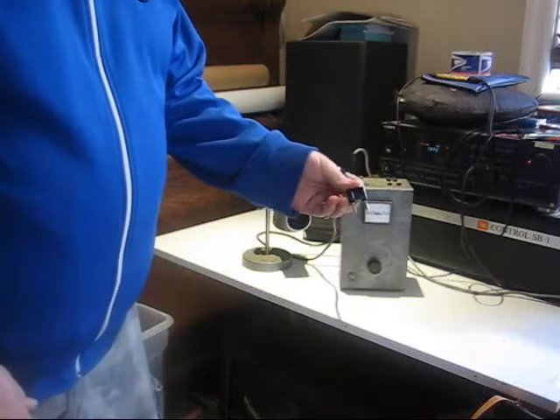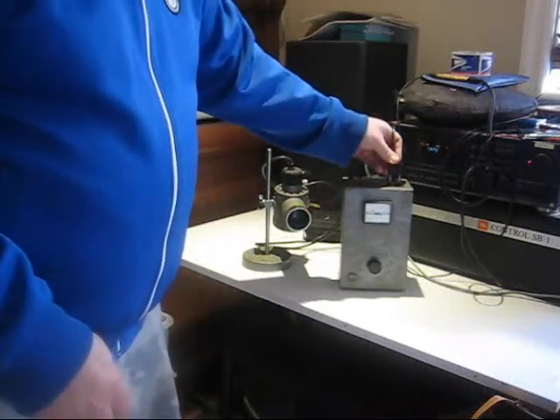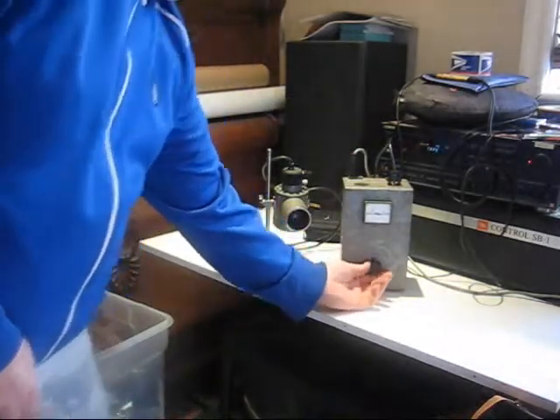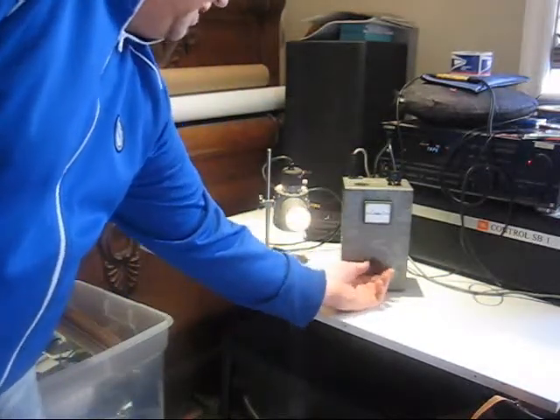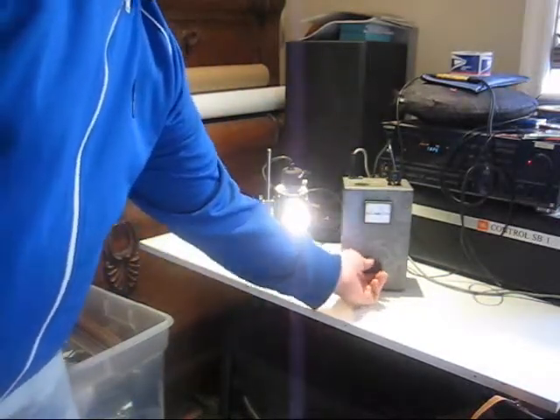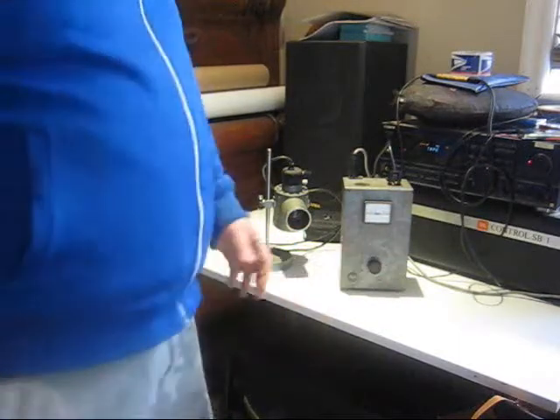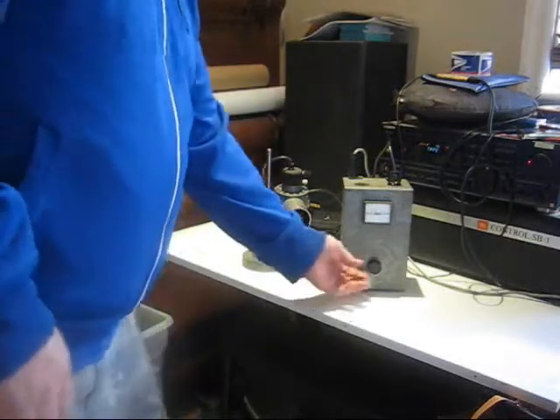It's got a two-prong plug that plugs into the top here, and then with the transformator you turn it on and you can adjust the amount of light you want to output. It's pretty cool if you're doing microscope work and you have a microscope that doesn't have a light built into it — works great.